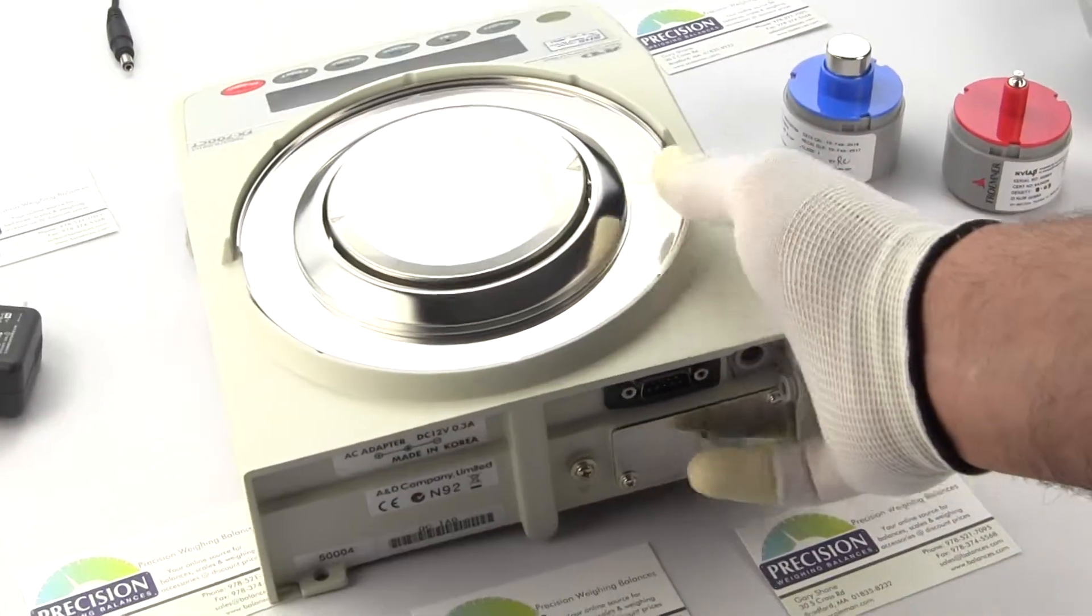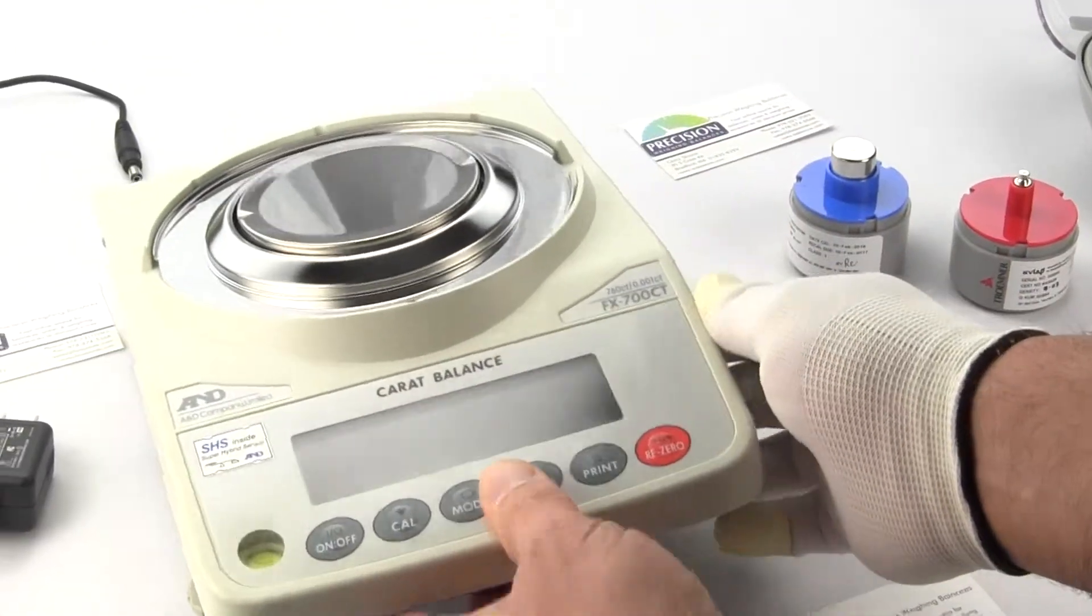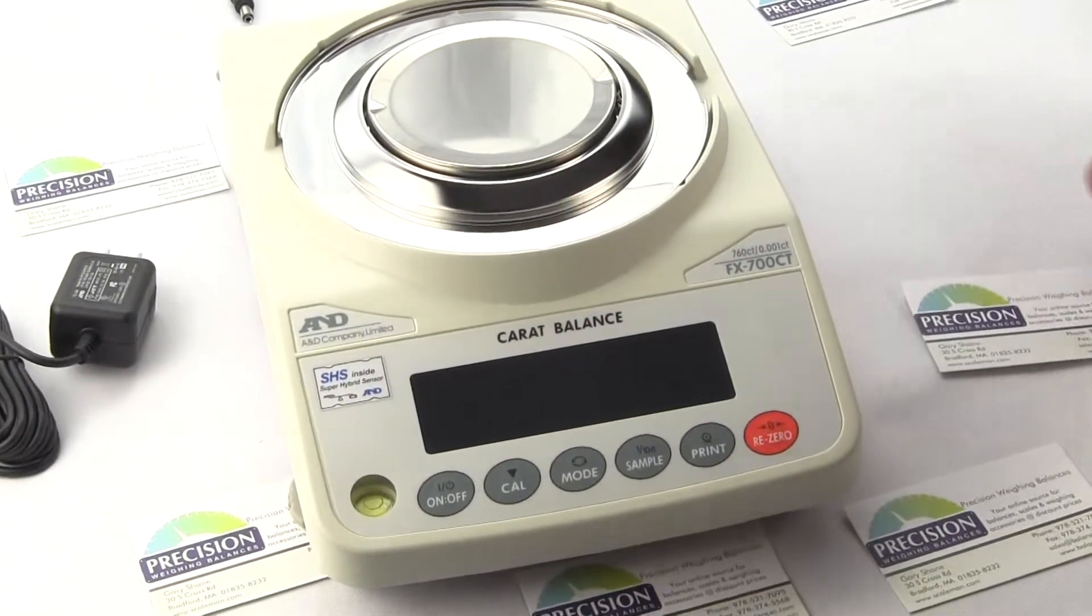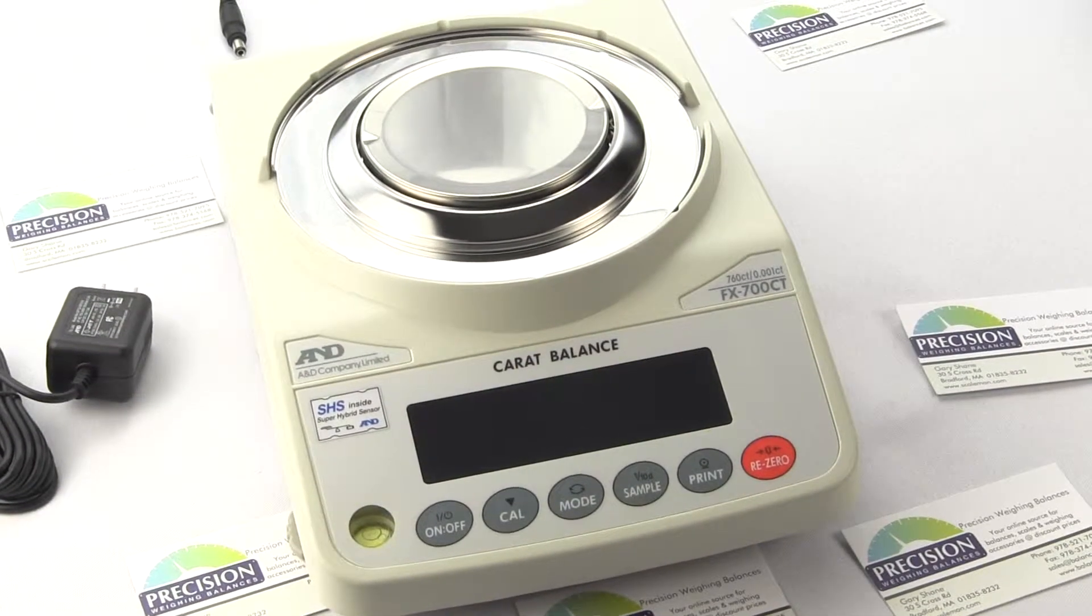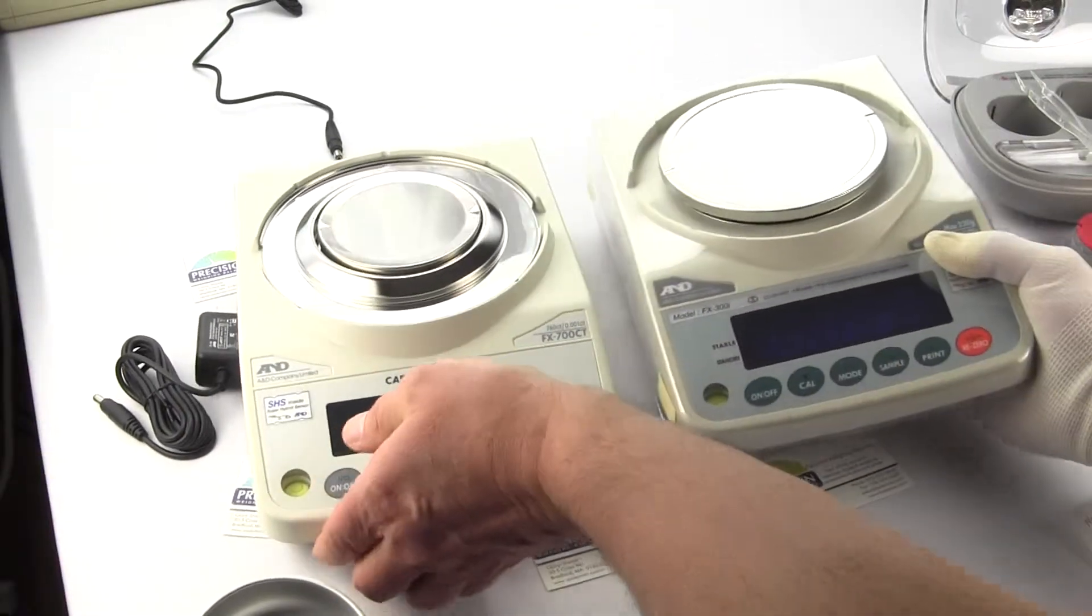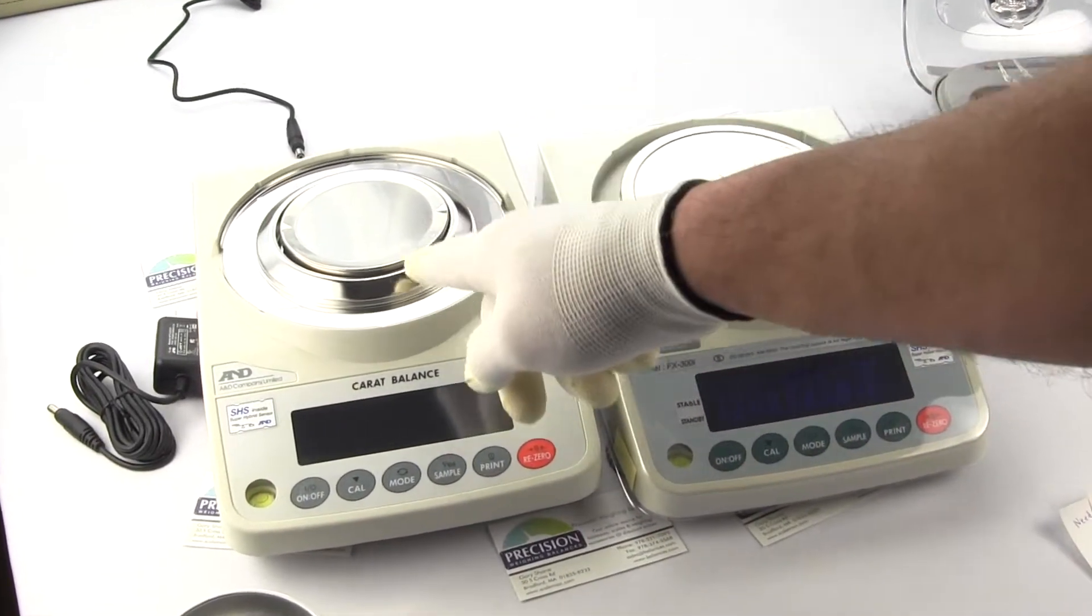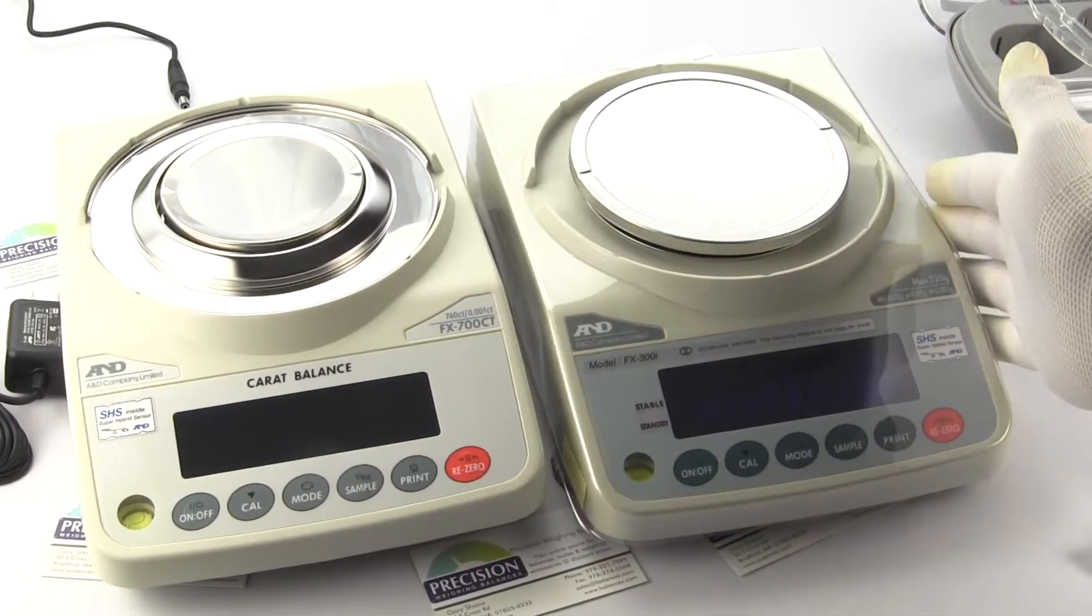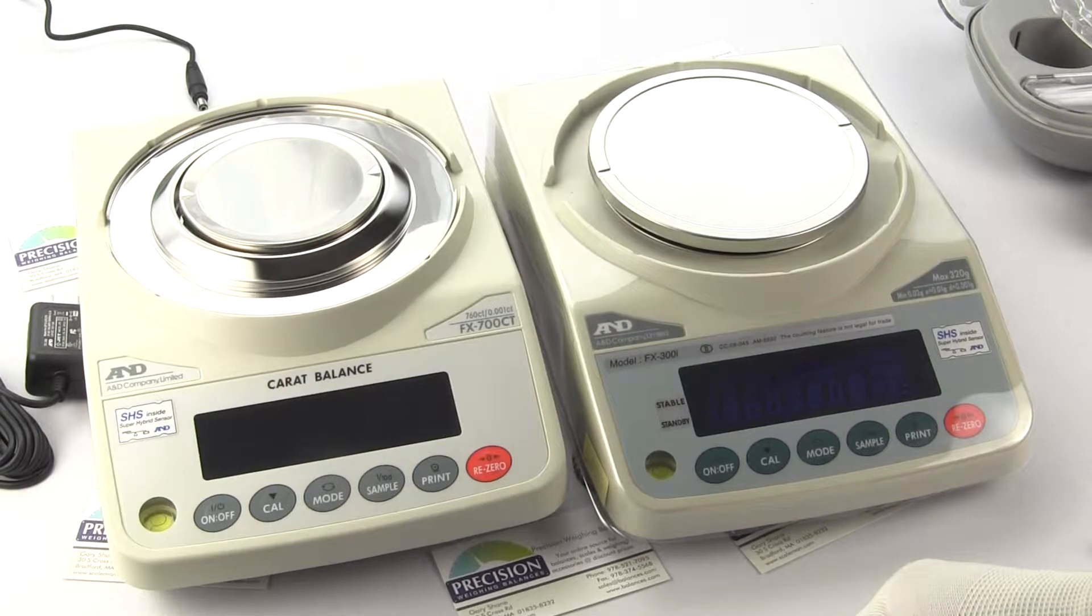So that really covers everything on the FX700CT. This balance it is using the exact same housing as an FXI milligram balance. So I have a unit here this is the FX300i. You will notice we have a smaller platform here so the carat scale is giving you a smaller platform. It's using the same housing but this balance is really more like A&D's HRA series.